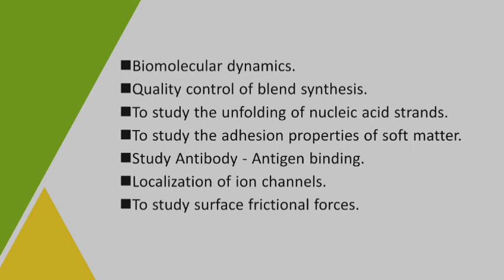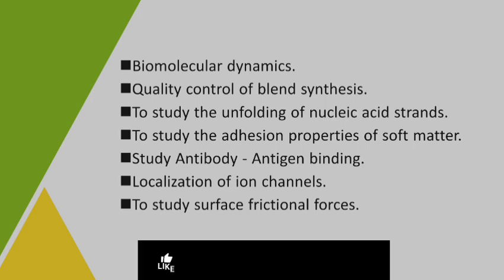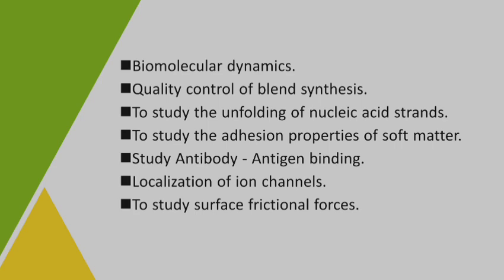So this is all about the history of the atomic force microscope, sample preparation, and the principle of working, and also the three different modes of working in atomic force microscope, and also the applications of atomic force microscope. I hope you understood the topic.